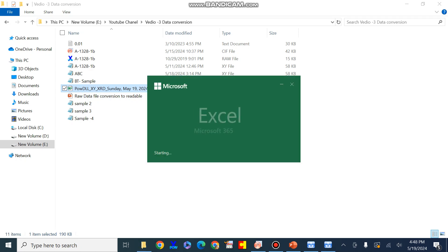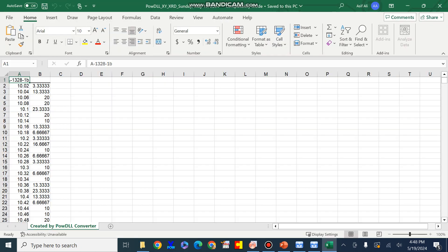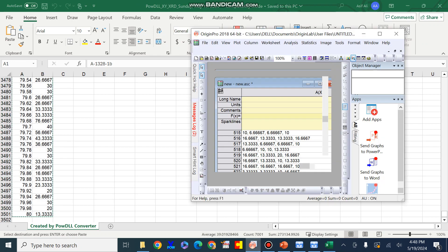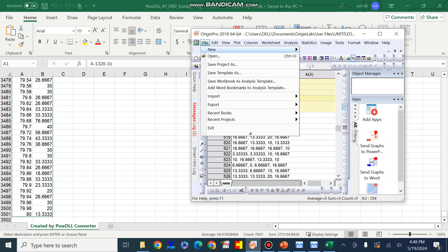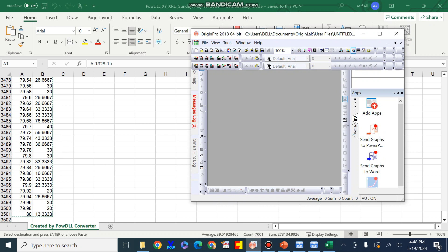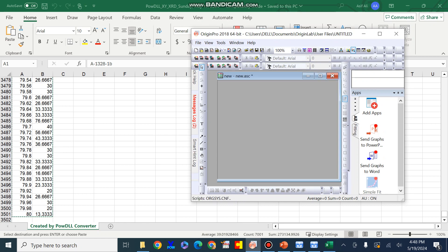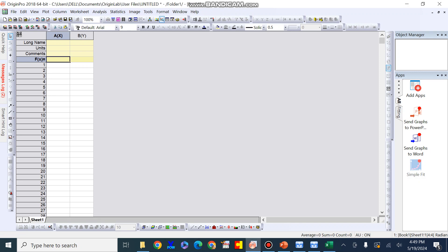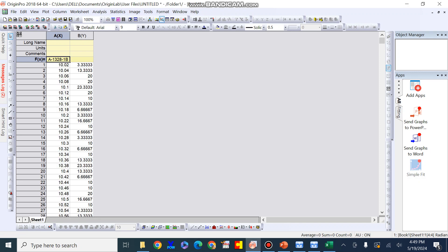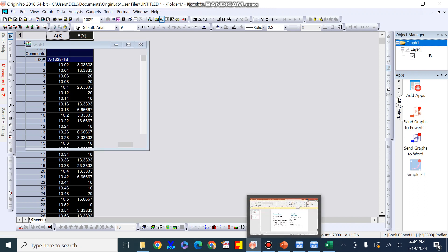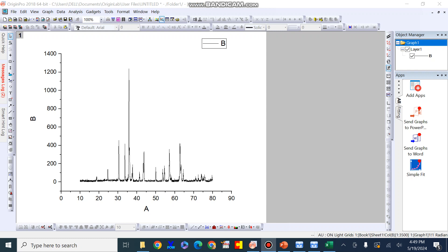Once the conversion is successful, open the Excel file, then press Ctrl+A and Ctrl+C to copy the data. Then open the Origin software with a new project or worksheet and draw the raw data file. It is now in a readable form for Origin software. Just paste the raw data file — which is now in the Excel sheet — into Origin and plot it easily.